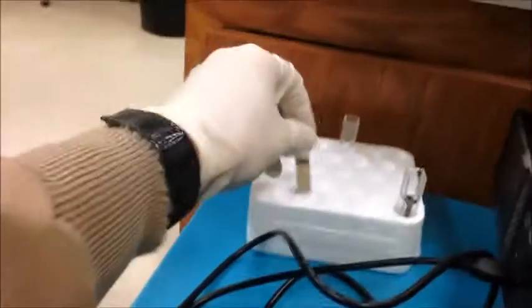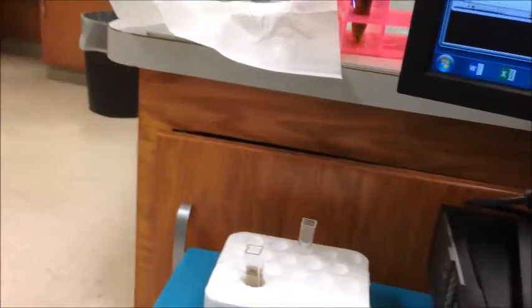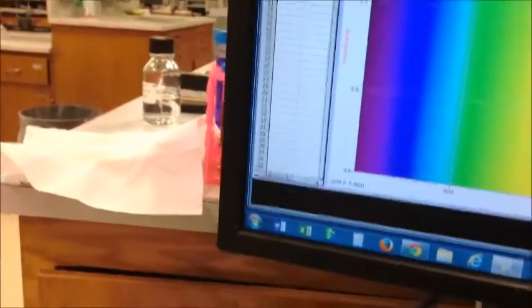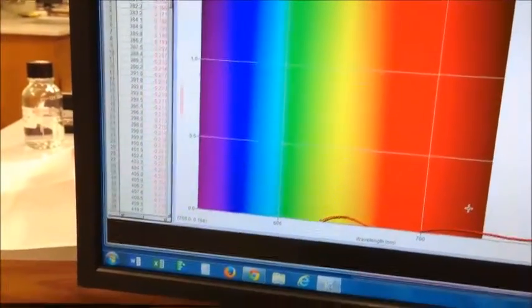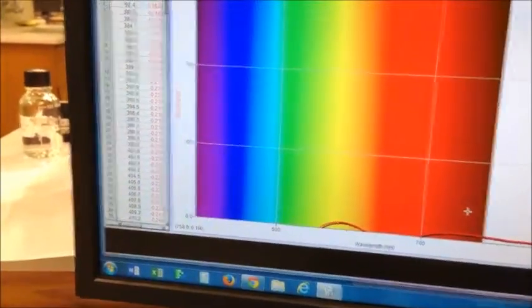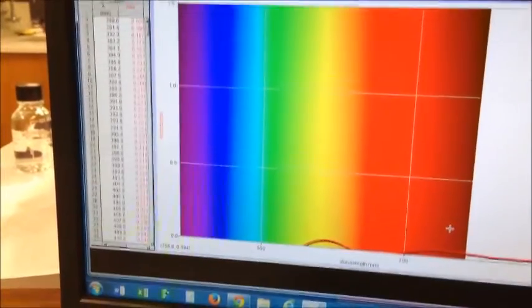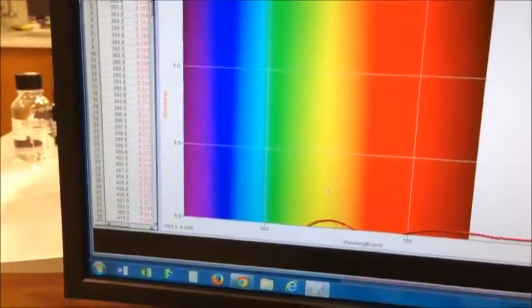So the next step after this is to take the sample. So here's some sample that has reacted Bradford reagent in it. You tell it to collect data. Now what it's doing is scanning and measuring what the absorbance is at every wavelength with the blue stuff in it.